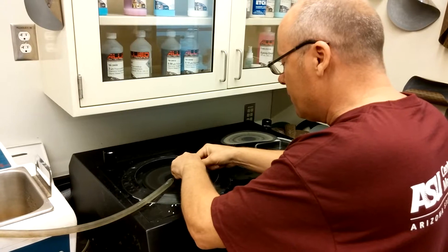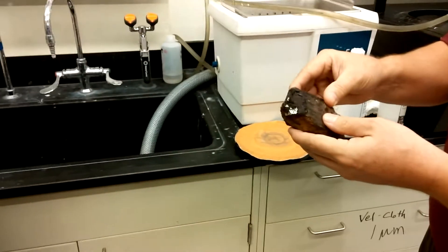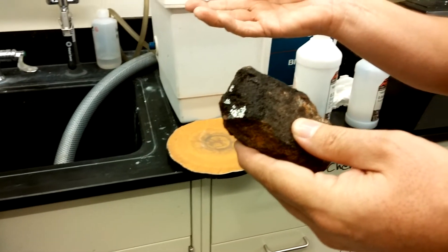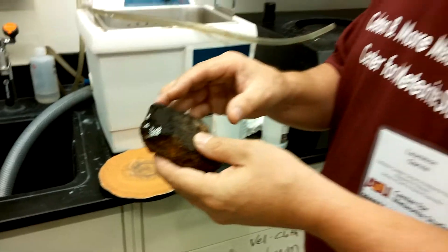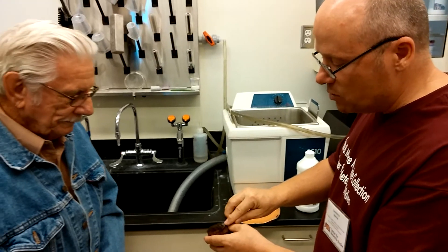You can see a bit of the metal coming off it — oh, look at that, isn't that beautiful! You can see the beautiful millimeter and sub-millimeter sized spheres of metal. Now since it's magnetic it's almost certainly iron, and I think this is some sort of compressed man-made metal object. Most of the spheres are about the same size as well.